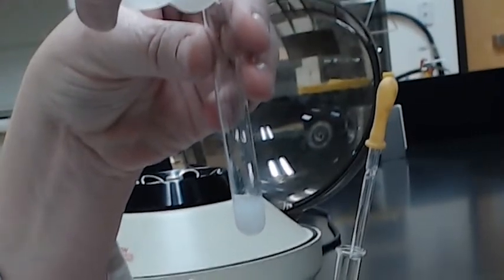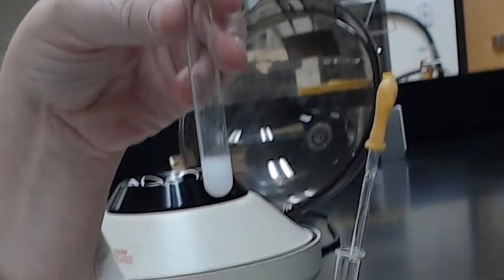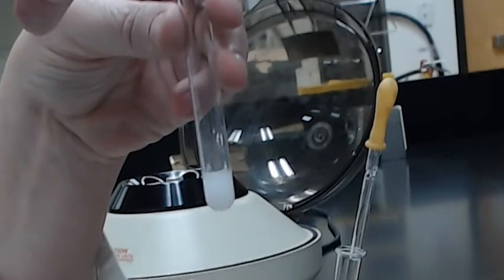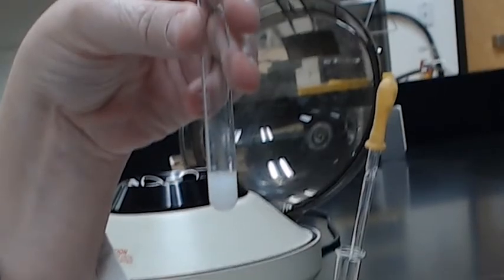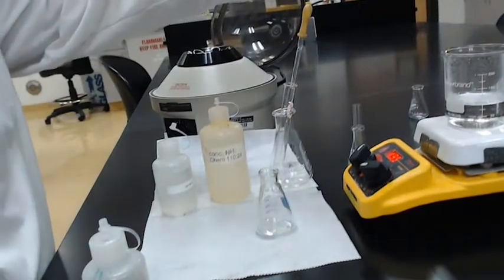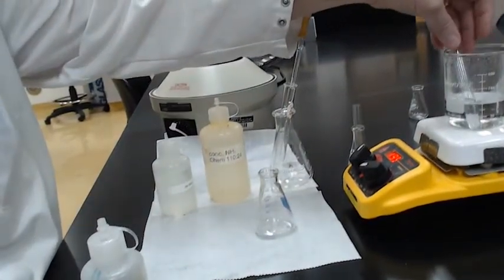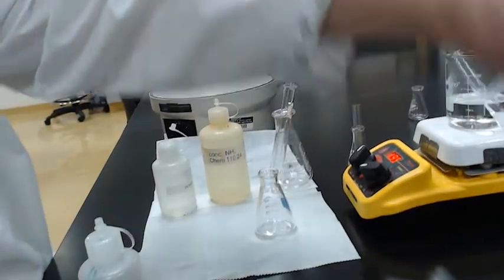I'm going to let it settle for a moment, and then I'm going to try the other drop. And that was just 2 drops of carbonate. We had another drop. Did it go darker white? Not sure. So add 1 more drop just to be sure. Okay, that looks like it stayed about the same whiteness for me. So now that we've added enough carbonate, we're going to set it into our hot water bath, which we preheated to just below boiling for 1 minute.